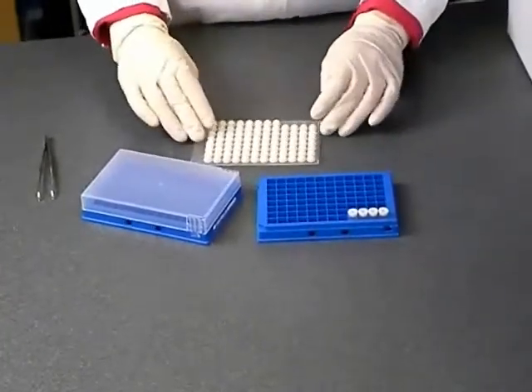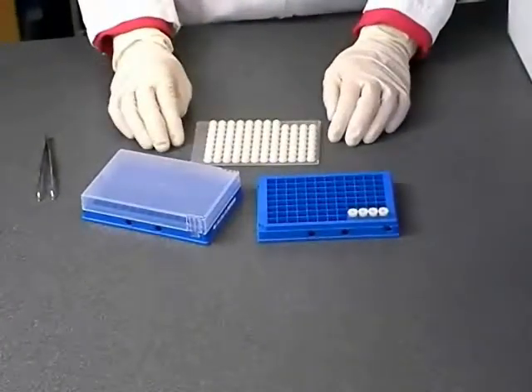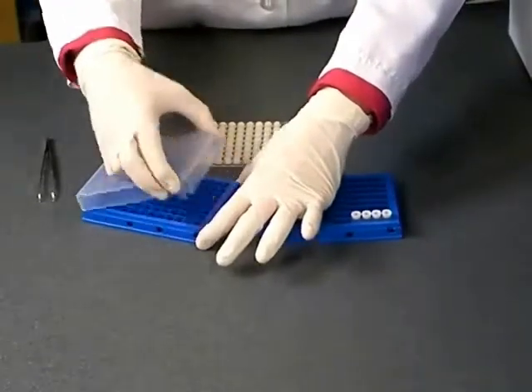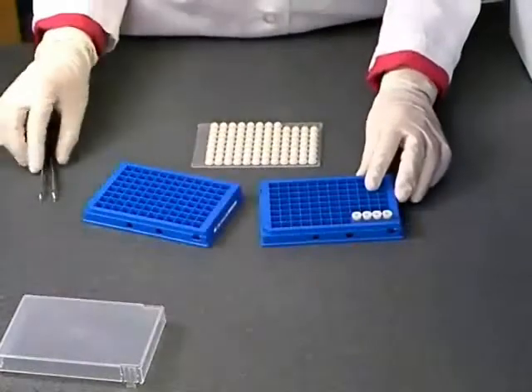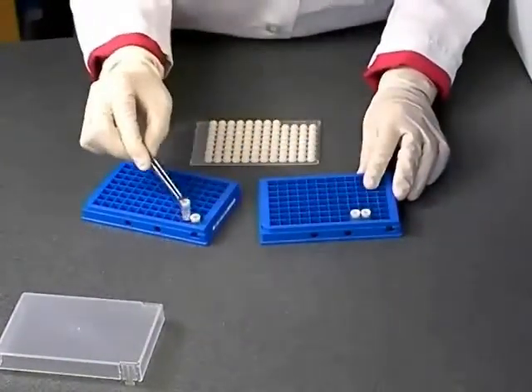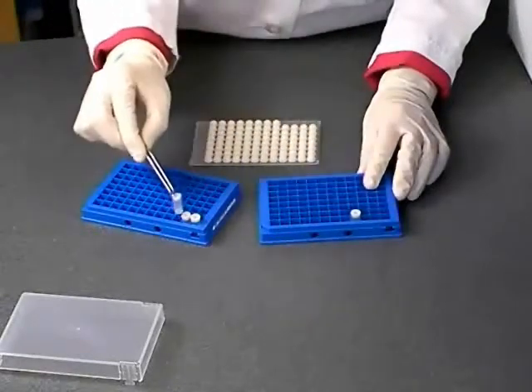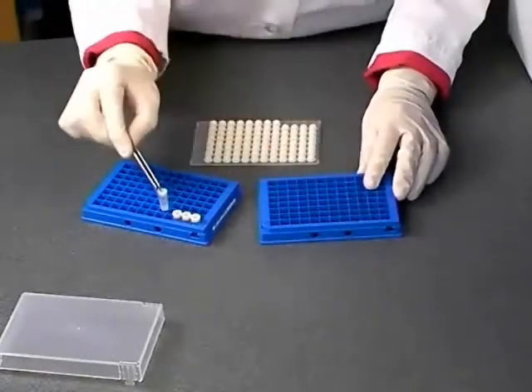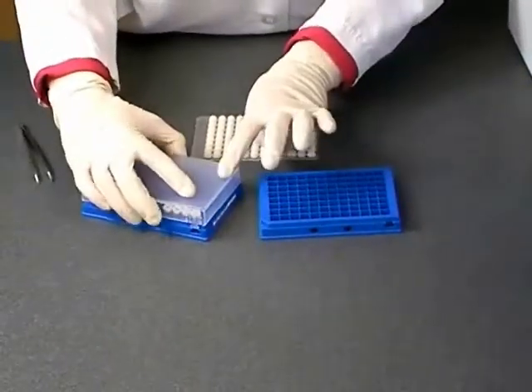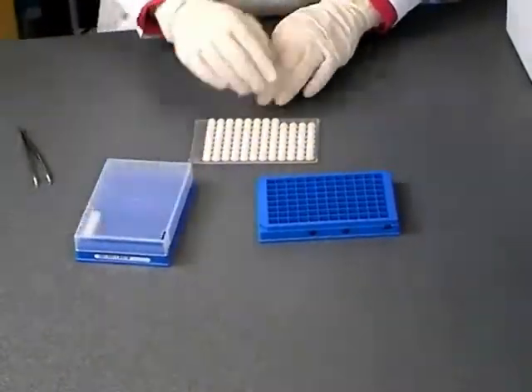After capping the tubes, remove the lid from your storage rack and transfer the tubes using your forceps into the storage rack for long-term storage. Replace the lid on your storage rack and now you are ready to store your DNA.